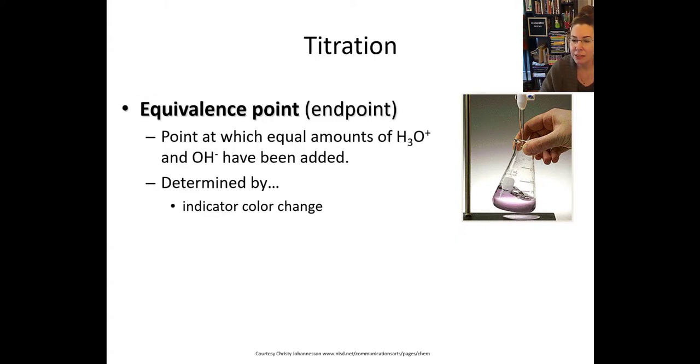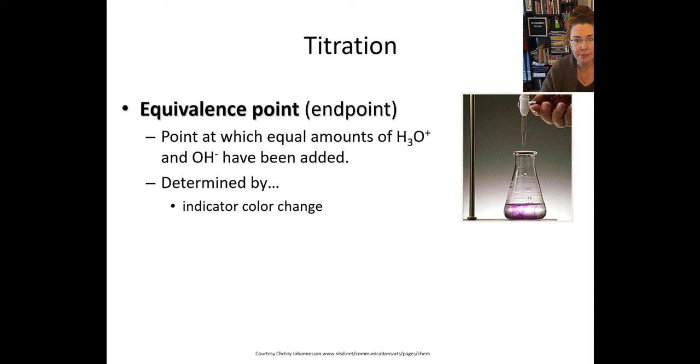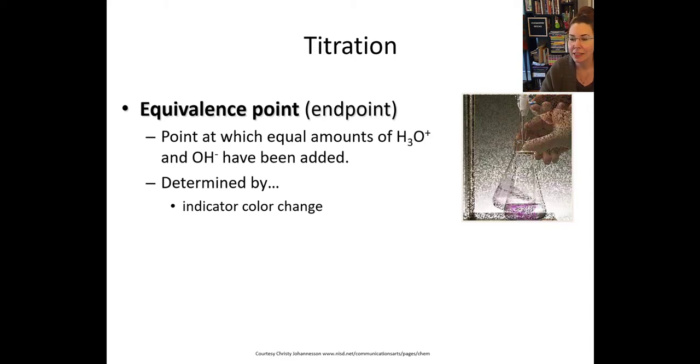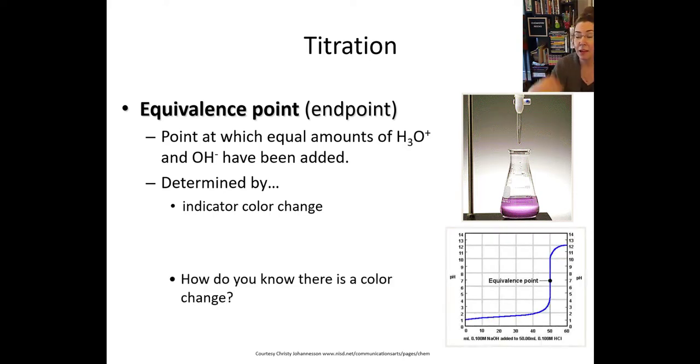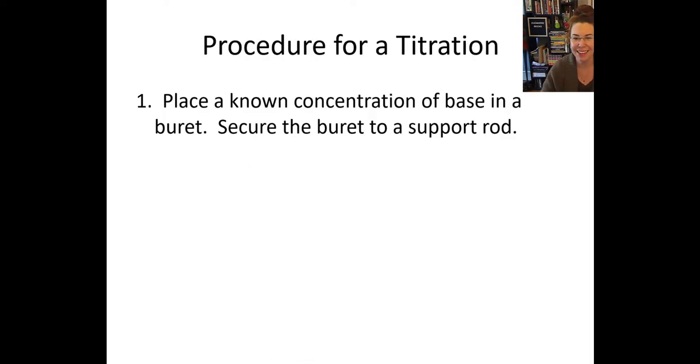So if you look, we've got a solution that we are adding a little bit of a base to. That's an acid in the flask. And in that flask is also some phenolphthalein. And drop by drop, we're adding a base to it until it hits a color change. So how do you know when there's a color change? You look at it. In phenolphthalein, we would be going from colorless to pink. You want your end point to be the spot where it just barely starts to blush, but it stays pink. And we'll talk more about that in just a moment.